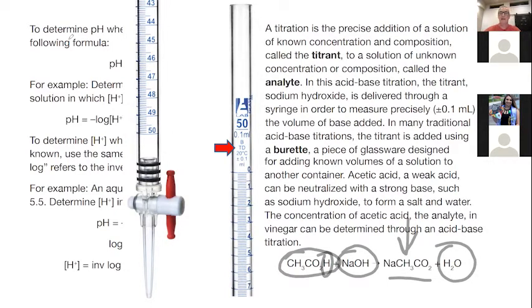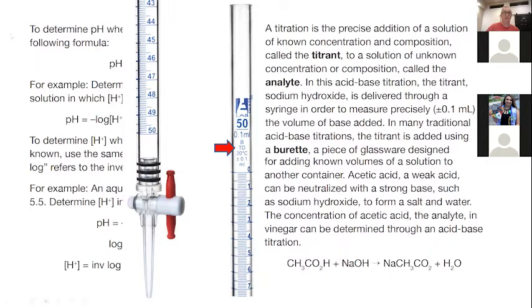Sodium acetate is a fairly strong base but it is complexed with sodium for a little while, and then that dissipates. And then we're going to have this base and then additional base. And so the pH is going to go up once all of the weak acid is gone. So we'll have a dramatic change in pH. So let's have a look and see what that looks like.